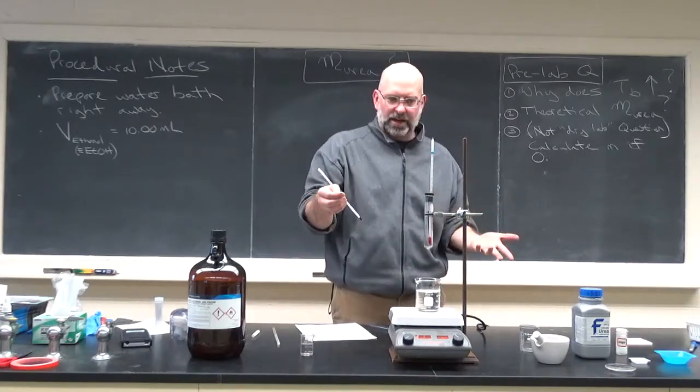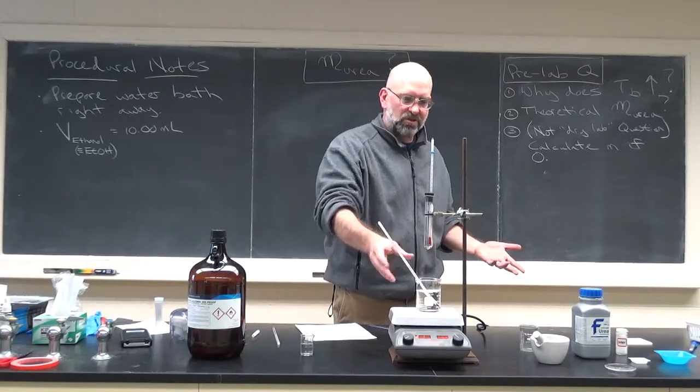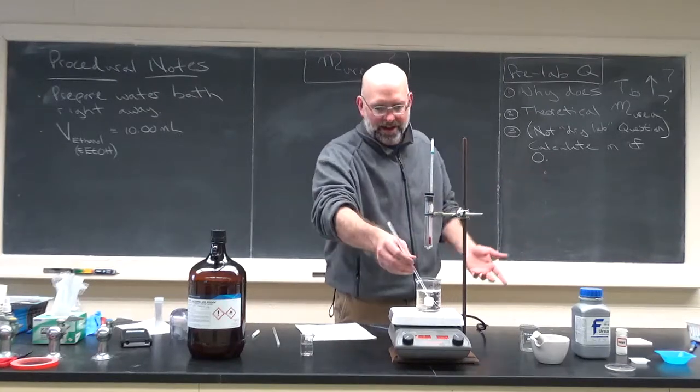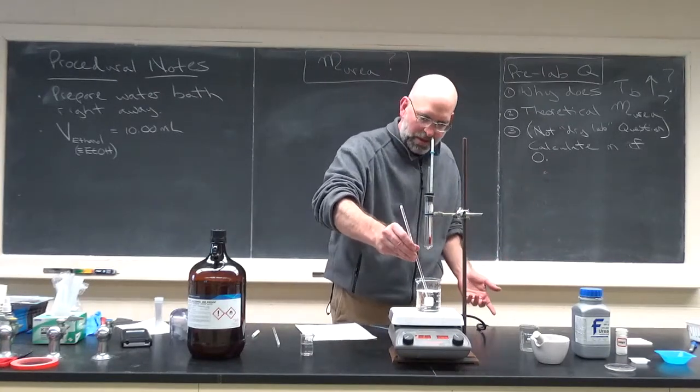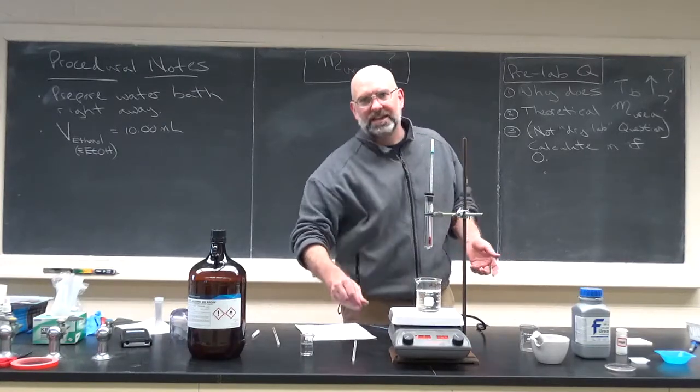Also, I think you're going to need another thermometer to check the temperature of the water. Again, you can plug it in. It's actually not a very safe thing to do because you can knock it over in this whole apparatus. But this is what you would do, just kind of suspend it in there to check the temperature of your water. Make sure it gets to around 90 degrees.